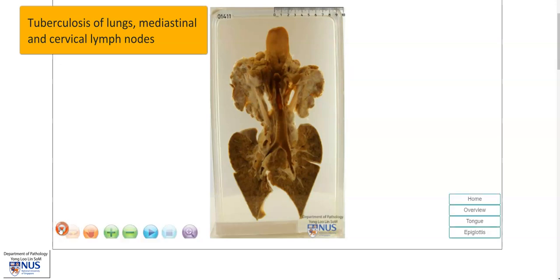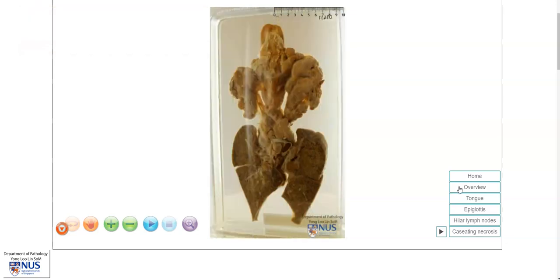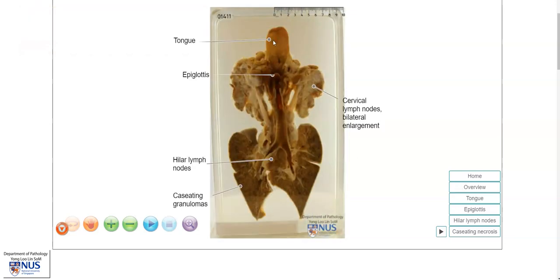Let's have a quick look at the anatomy. This is the tongue. Here is the epiglottis, and we have the larynx here, the trachea, with the main bronchi, the hilar lymph nodes, and both lungs, and we also have very enlarged cervical lymph nodes. The main pathology is seen in the lungs, the hilar and cervical lymph nodes, and let's take a closer look.